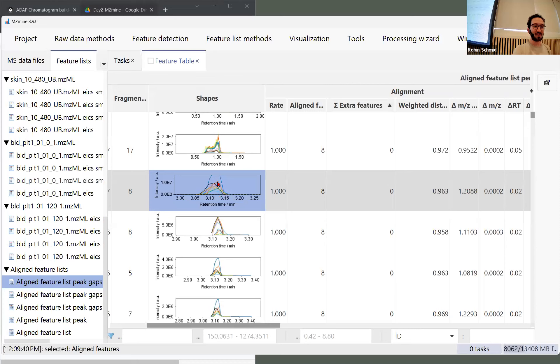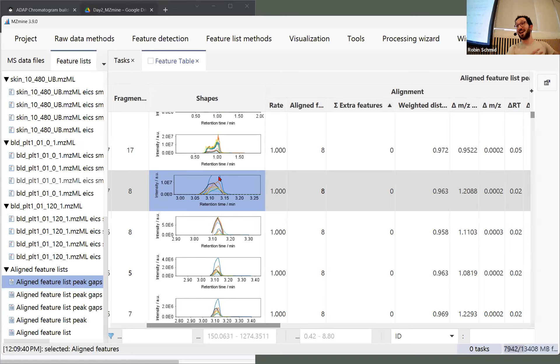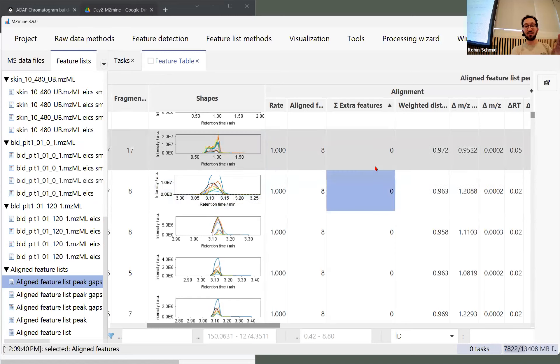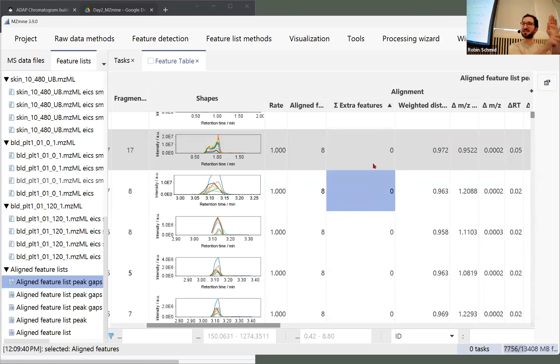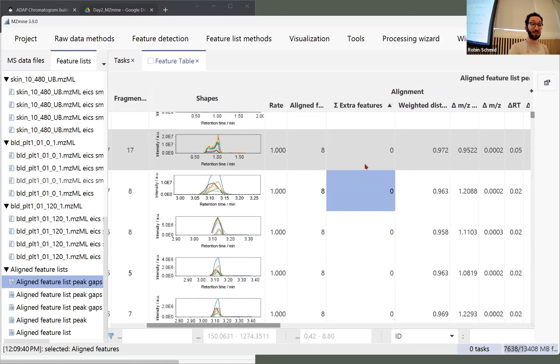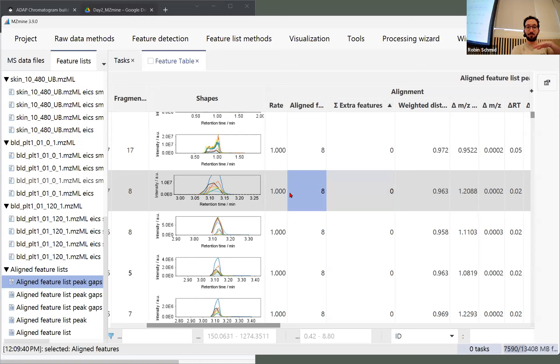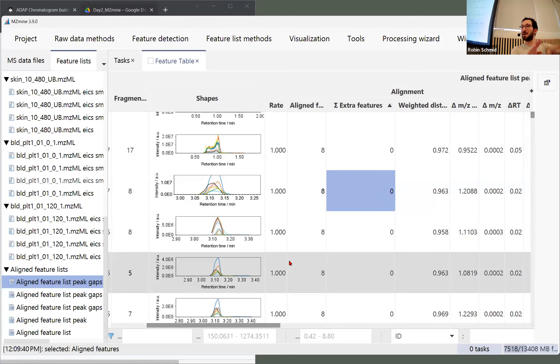If we sort by rate and then by extra features, going to the top we should have full alignment and no extra features — meaning there was only one candidate in each sample for matching m/z and retention time. Features are defined by those two properties. We can zoom in and see that all eight samples had features aligned with no shoulder, no extra feature, no isomer in this wide retention time range. For 88 samples there might be shifts, so we need to account for that — the extra features count additional features in a sample not aligned to this row.